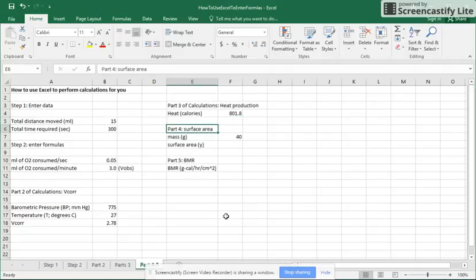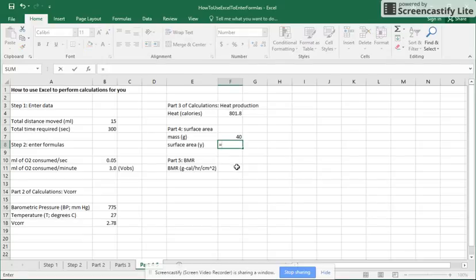In step 4 now, we're going to use the surface area. So to calculate the surface area, we're going to use the formula y equals a plus bx. So surface area, we're solving for y, is going to equal A, which is the constant, 0.437, plus BX, so B in this case is also a constant, 2.143, and we're going to multiply that by our weight that we measured. And we didn't use any parentheses, so just enter should give us our value, and it does, 86.2 centimeters squared.